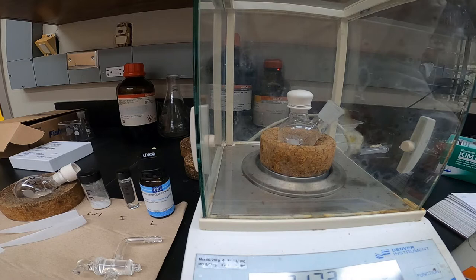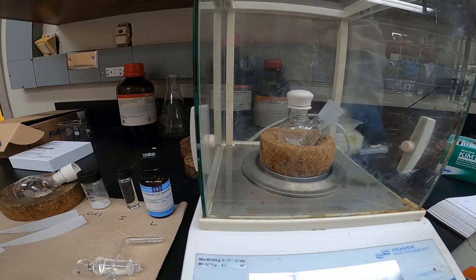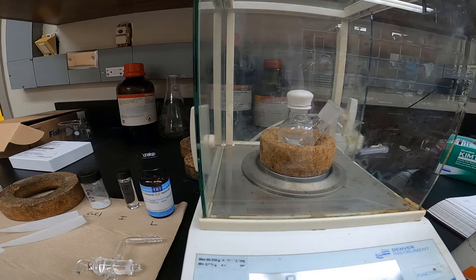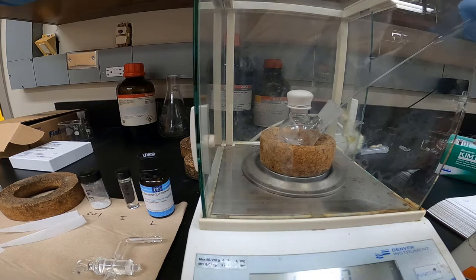After adding each reagent, I also made a note in my notebook with the amount added. That way I have a record of what I did. Next up, I added the monomer. Going from here, I'll speed the video up some, that way it's not such a long video.